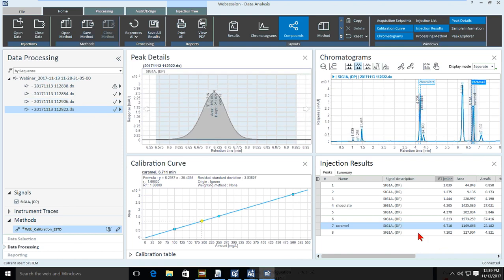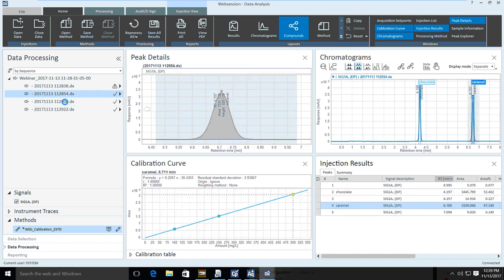For each one of these runs, the calibration curve builds on itself. So here's your 3rd one. You've got 3 plots of data. This is how the software works, allowing you to clear at level. If I want to clear at a level, I'm only clearing out 1 calibration level and not all 3. So you have functionality for all individual ones.